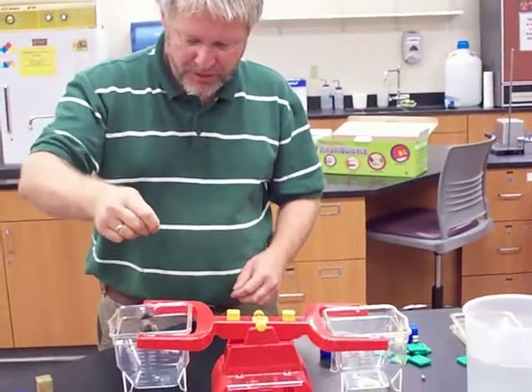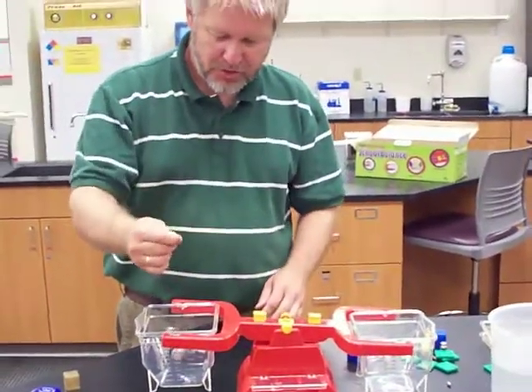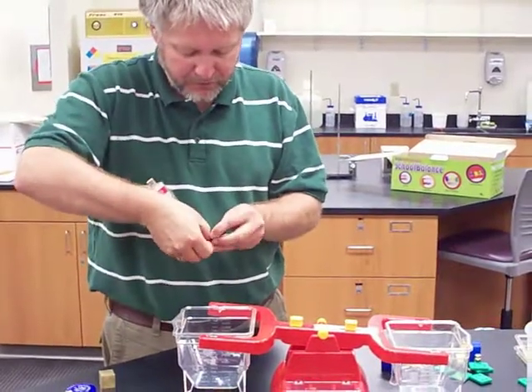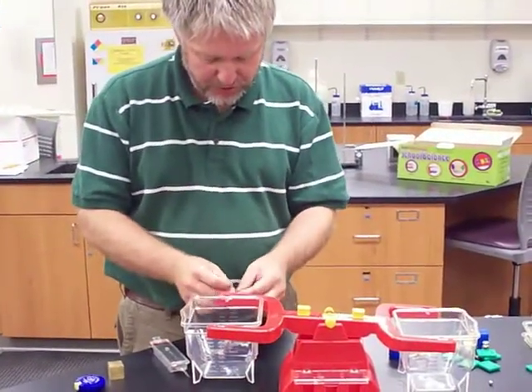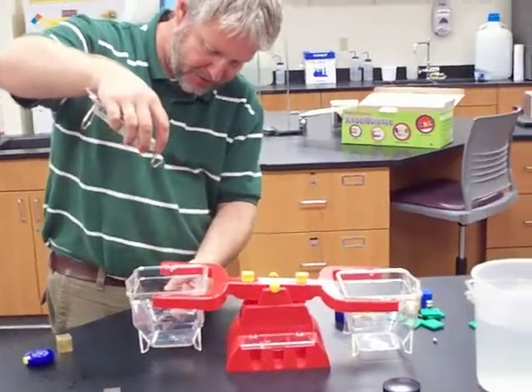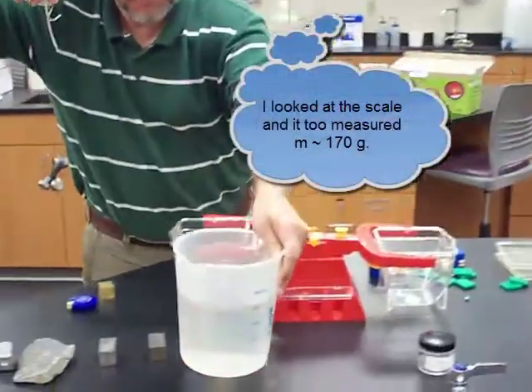One of them would be I could fill water in both of these here and then immerse it and measure the immersed mass, or I can measure the effective mass, and that's what I'm going to do, simply because these screws are a little bit too big for these containers. They wouldn't fit nicely in here. Well, they could just about work, but I really have to fill it up. So I'm going to use the other method, which is the effective mass.